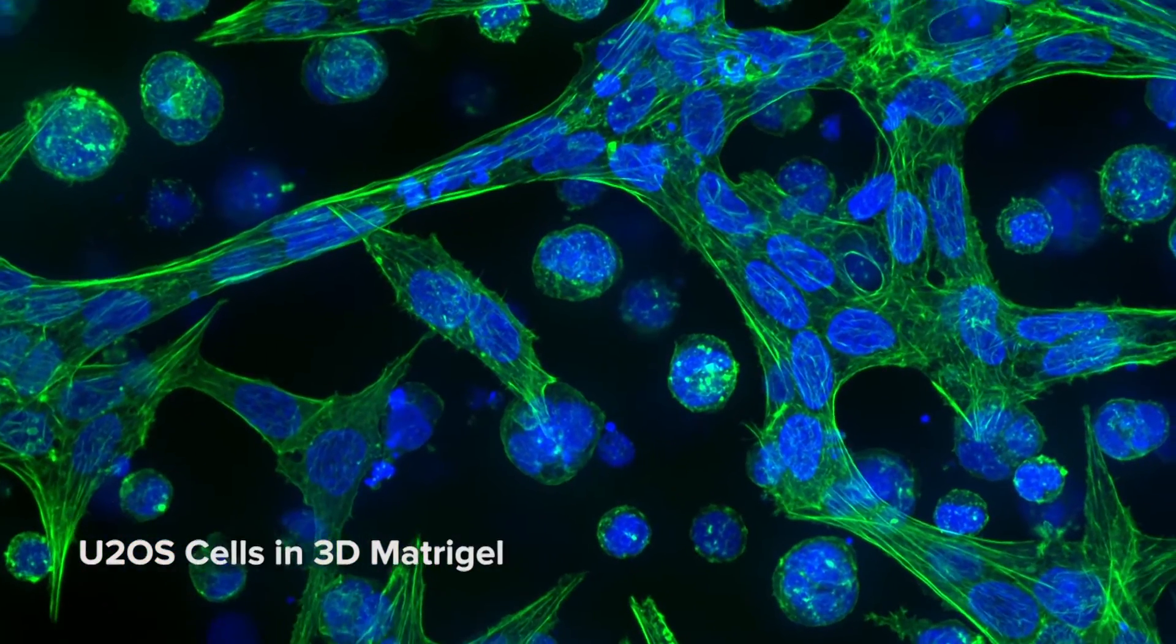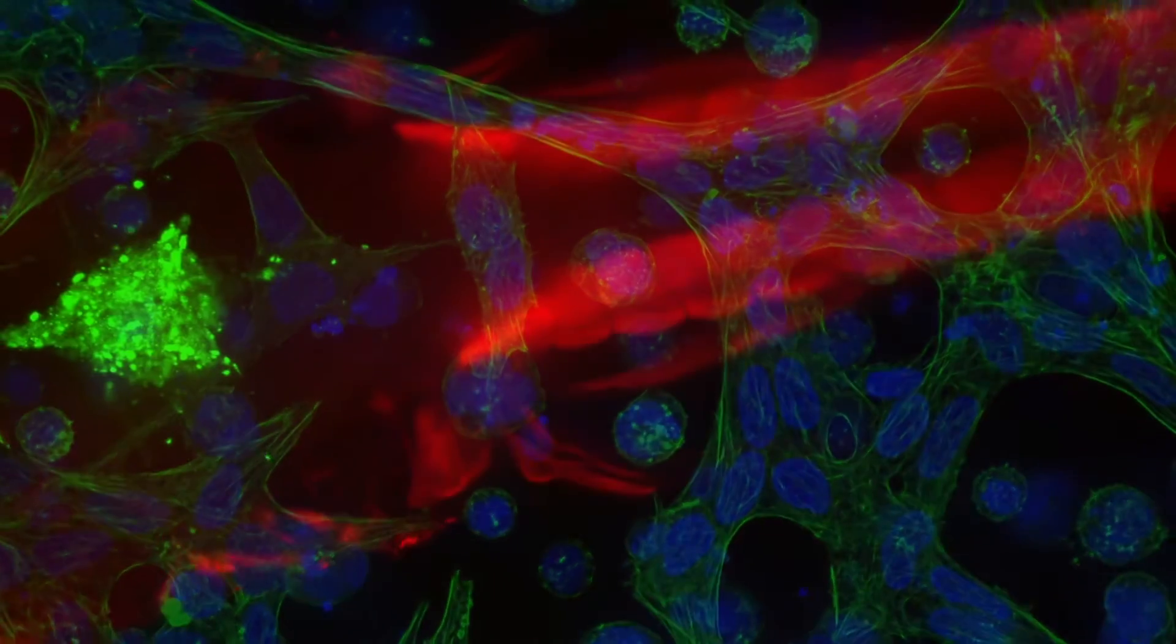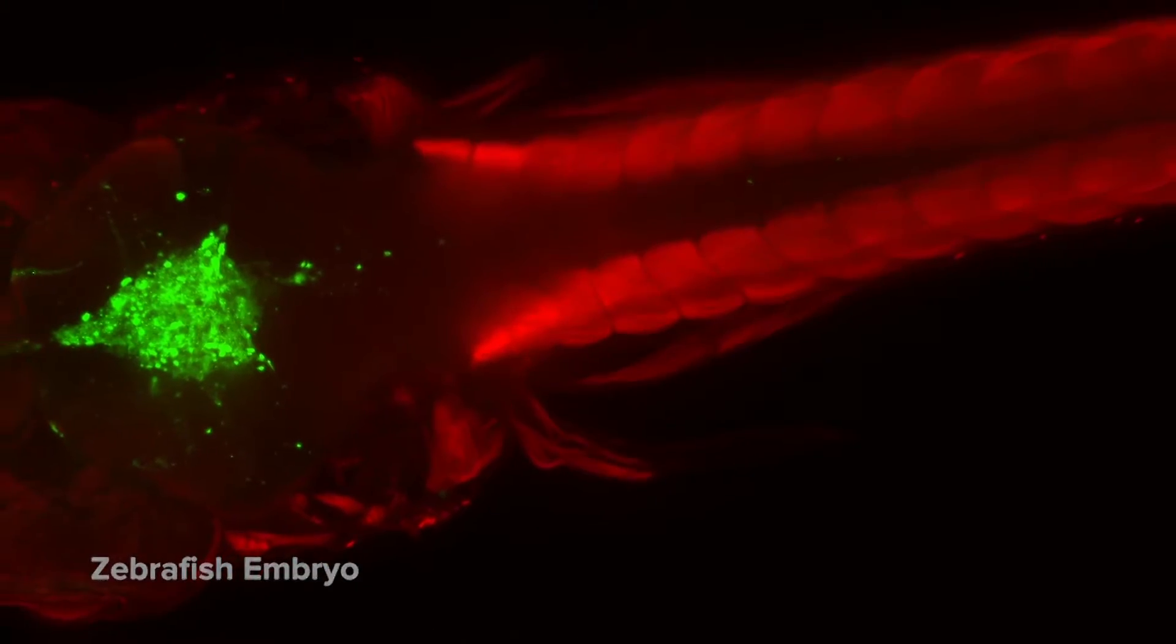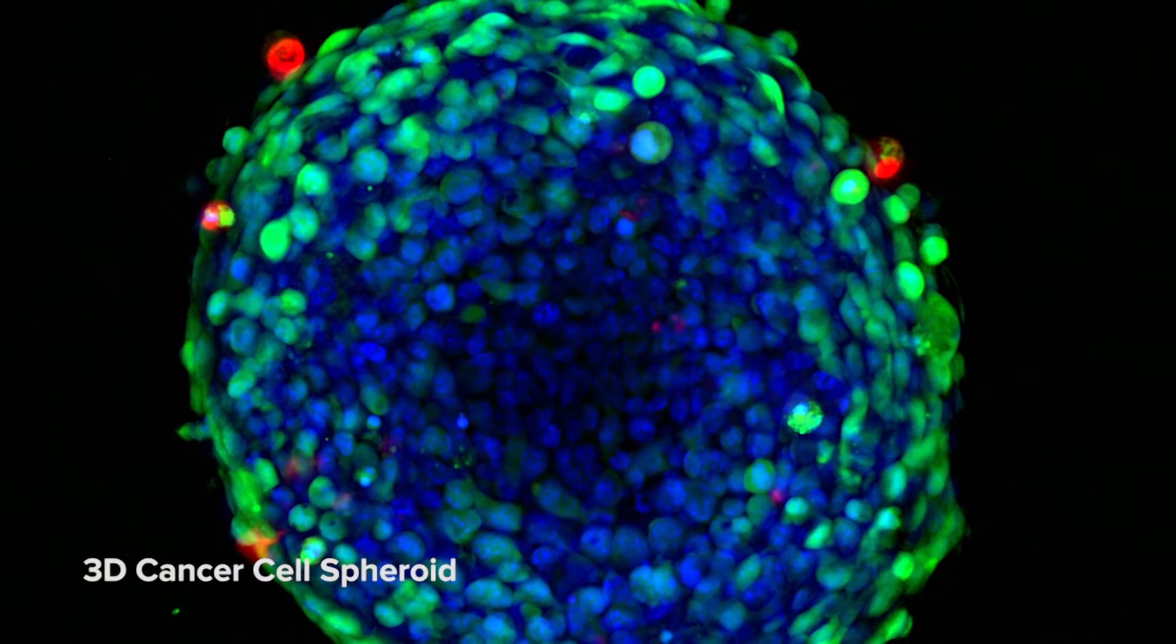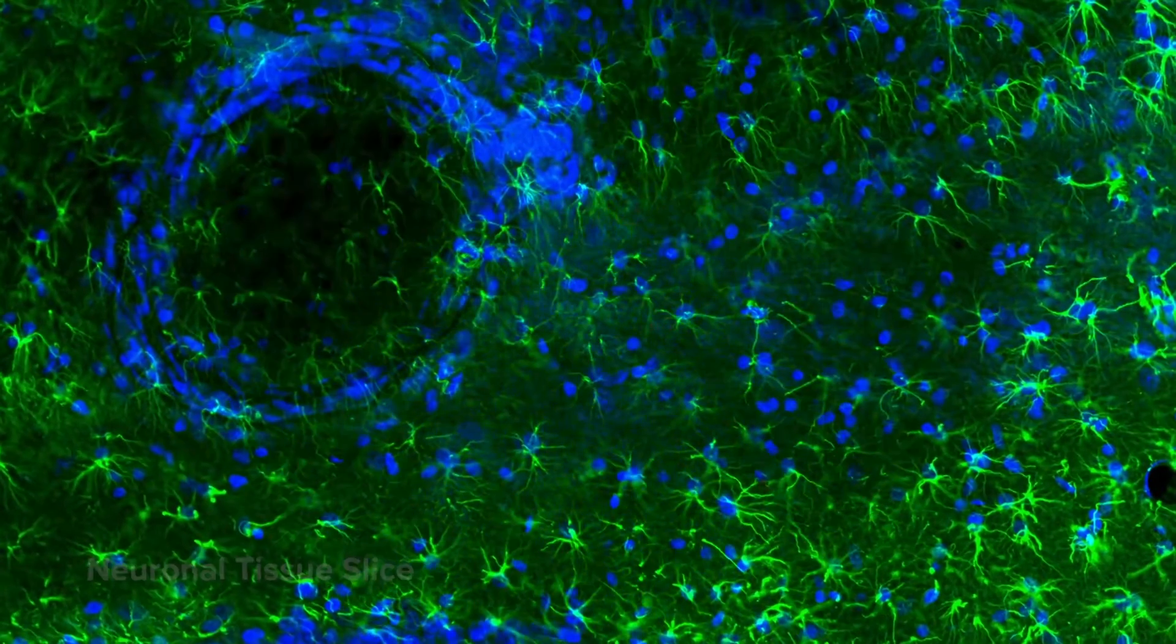They must capture structural detail and accurate marker localization in complex physiologically relevant 3D tissue and other high background biological models. Screeners are also challenged to view or process volumes of data and images that the research generates.